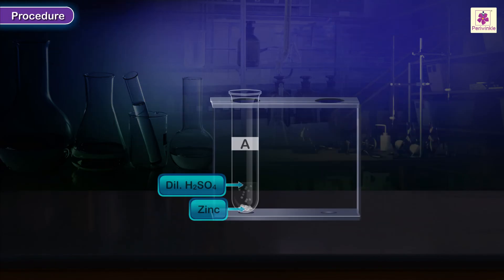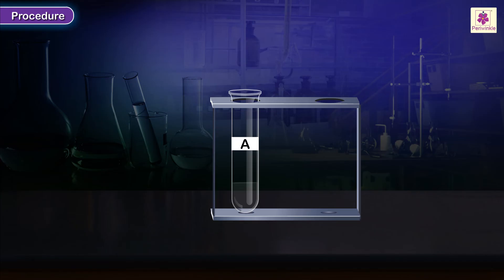Procedure: Place the test tube on a test tube stand and wait till the reaction in it is over, indicated by stoppage of bubbles forming in it.